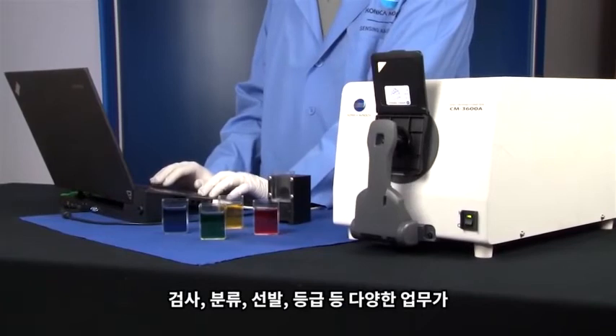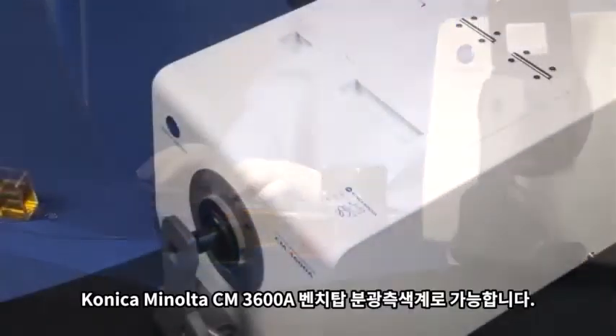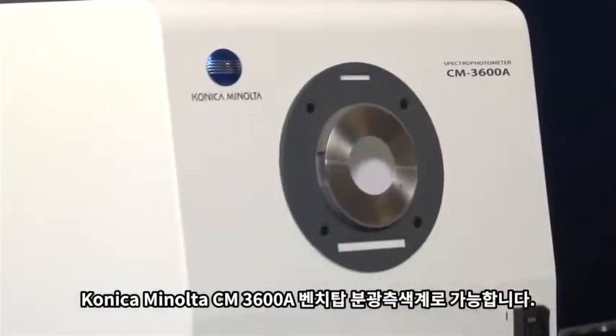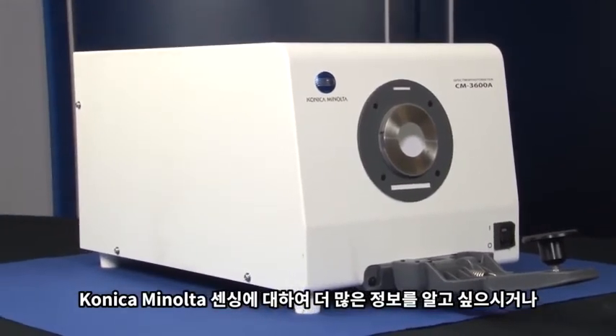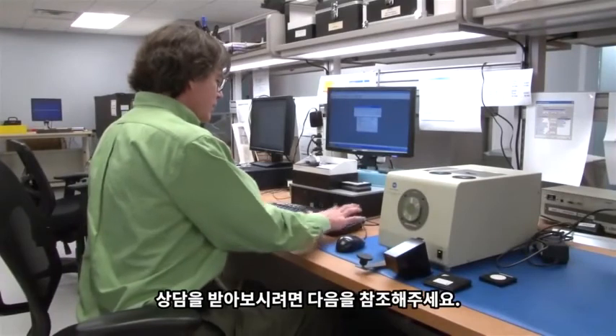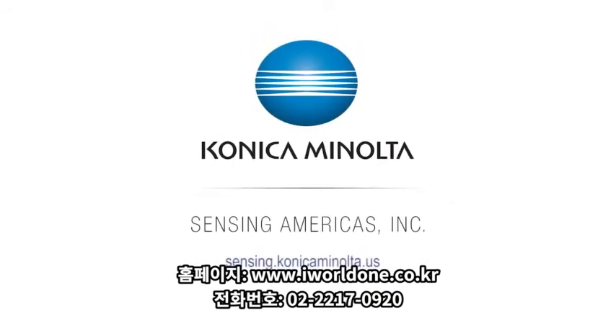Inspect, sort, select, classify, or grade your product with Konica Minolta's CM3600A Benchtop Spectrophotometer. For more information on Konica Minolta Sensing's full line of color measurement solutions, or to schedule a free demonstration with one of our color experts, visit us online at sensing.konicaminolta.us, or call us at 888-473-2656.